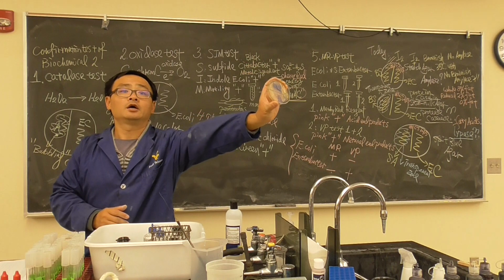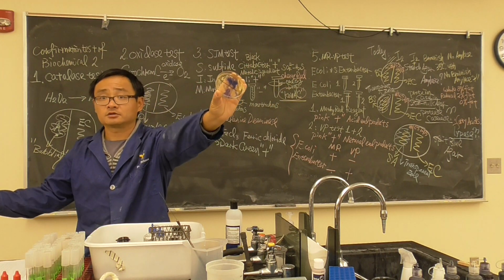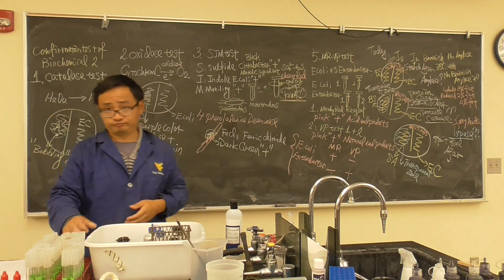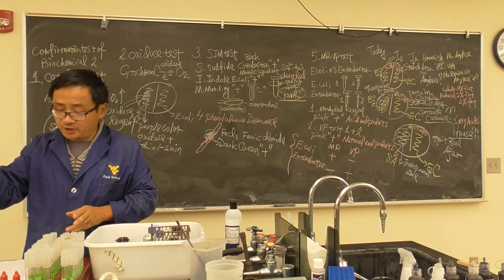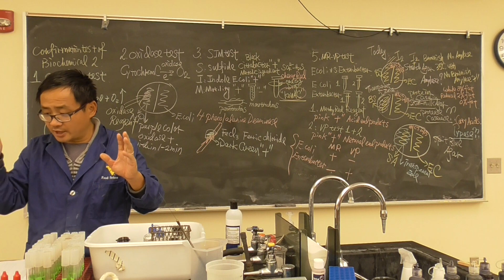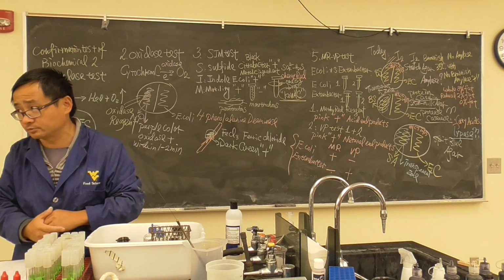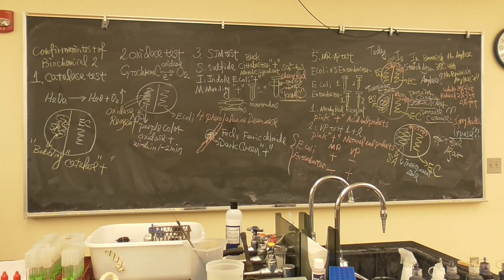Look at here. Once it's more than 1 minute, what happened? They both become purple, blue color. So that's why I tell you, you have to do this within a minute. Okay? And another thing I want to mention, the VP test, it may take a little bit longer. So the VP and MR reagent, you could put on your rack, and we can look for next Tuesday because it takes a couple of hours to react sometimes. It really depends. Okay? So we can go ahead with it.